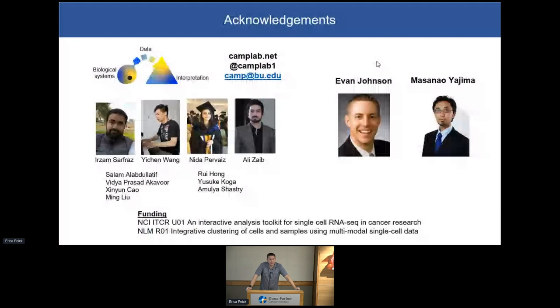Yeah, that's a great question. So we didn't know about that tool. That would be something that would be great to incorporate because with the framework in place, it becomes very easy to incorporate new tools. It's really easy if it's a Bioconductor package that already uses SCE objects, because then it's even less work for us. But that's a great example of something that could be added.